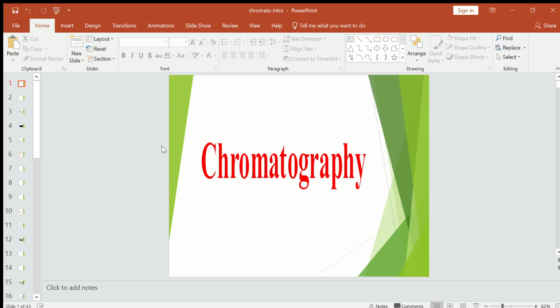I uploaded a video a few years back that I'm going to start a series of lectures on chromatography, but I couldn't continue that. So now I decided to continue that series, and today's lecture is part one of the chromatographic lectures. In today's lecture, you will learn what is chromatography, its basic terminologies, how you are going to perform chromatography, and how you are going to calculate the RF values.